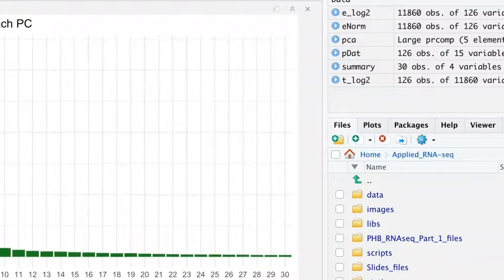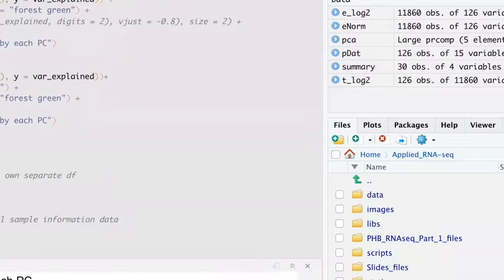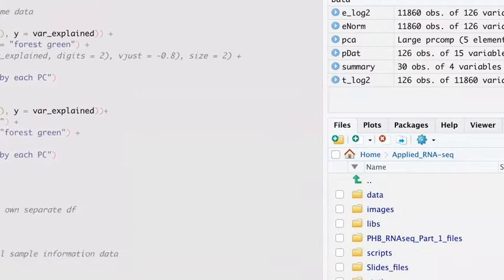So we see that the variance explained over here is what we were looking at, about 34. You can again change the y-axis to a percentage axis if you want. Now, if you wanted to do it with just a dot plot, that's also something you can do. It's just different ways of visualizing the same data. You can do the same for the cumulative.